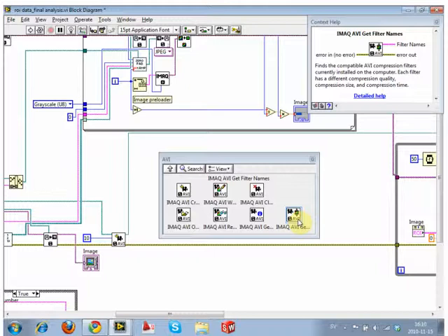You'll probably find you'll never use it, because most of the time, it's recommended that you don't compress your data if you can get away with it. There are lots of good ways of compressing your data in the videos, unless you have to just to show somebody. But if we can get away with not compressing the data, it's much better, because then you don't ever have to save your output files, because the AVI is just a stack of bitmaps, which means it contains all of your original data. If you compress it, it's not the case anymore, and then you have to keep all of the original files.